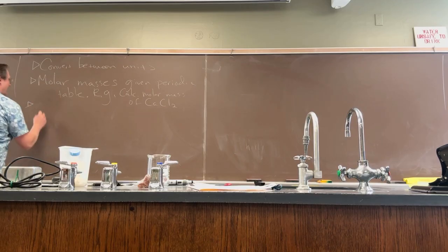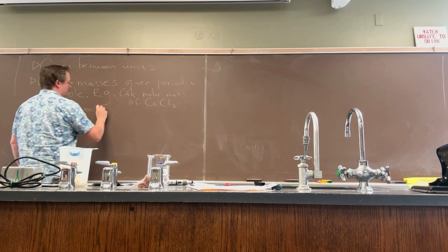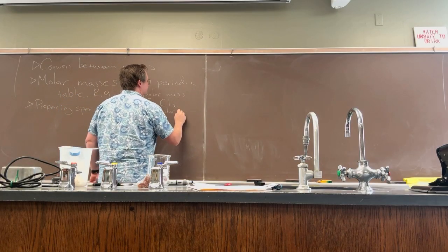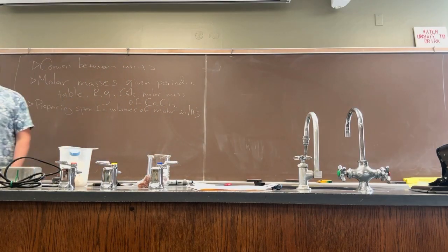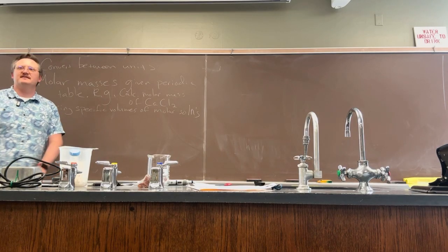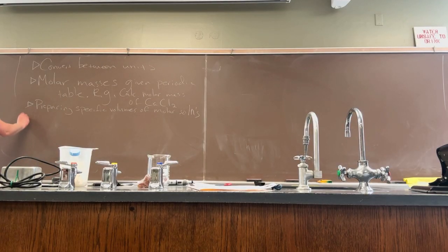Next, preparing molar solutions. Preparing specific volumes of molar solutions. Cool. Make me 400 milliliters of a 3 molar solution of calcium chloride.